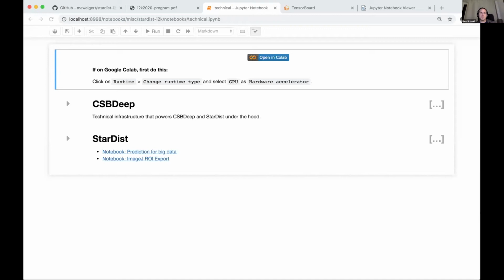Okay, I'm not sure, are you already overwhelmed with everything that Martin presented? Because I'm going to talk about some quite technical topics. This is mostly meant for people who want to maybe develop their own neural network and want to use some of the tools and infrastructure that we have in CSBDeep especially. I'm trying to understand how much time I should spend on this, or just for people in facilities who maybe want to distribute pre-trained models and such things. And as I said in the beginning, this is new content, so it's maybe a bit rough still.